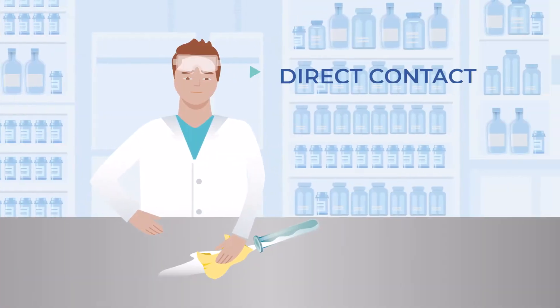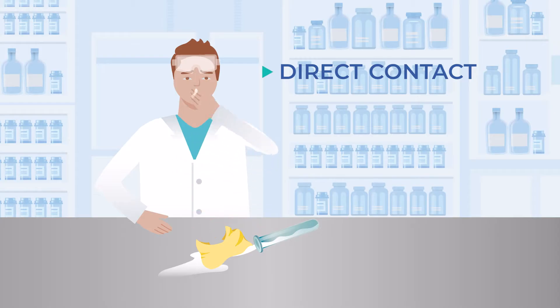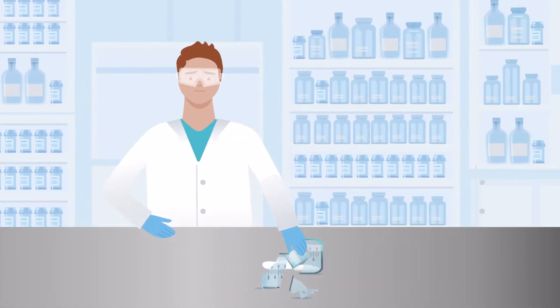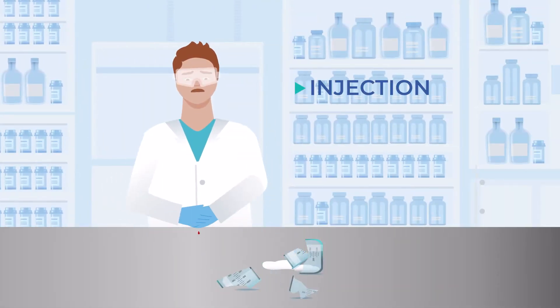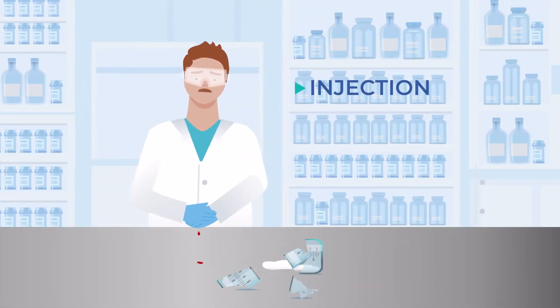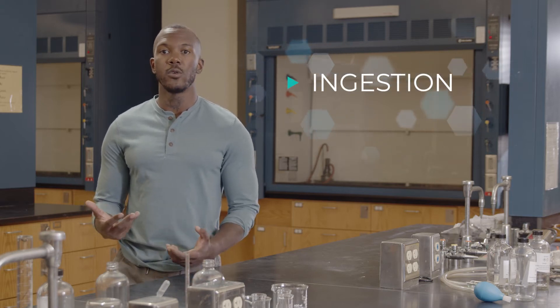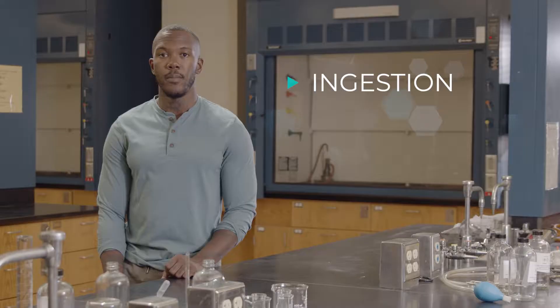The second most common route of exposure is direct contact with the skin or eyes. The tissues of the eye are extremely sensitive to damage. Two less common routes of exposure are ingesting a chemical and injecting a chemical through the skin. Injection can happen if you cut yourself on broken glassware that is contaminated with a chemical. Ingestion isn't very common since tasting, drinking, or eating lab chemicals or food is strictly forbidden in the lab.